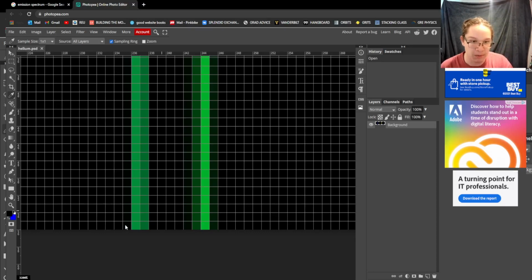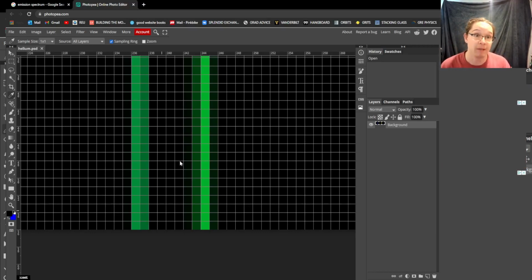What the issue was, if you can see here, that RGB value is not pure 0,0,0 when it should be black. And if I move over one more, still not pure black. Another one, now we're at pure black. This one is one of the ones that I haven't edited. But what I did is I edited it and turned all of those into pure black where they should be.